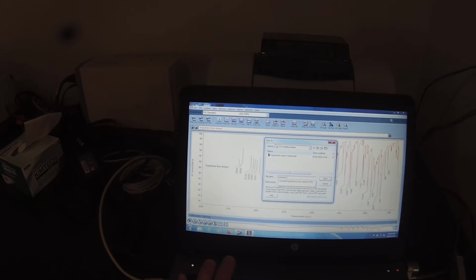So, and it's clearly not a very good match anyway, right? There's the phenol OH stretch. It's not there. This NH stretch is much more noticeable. I'm going to print this one while I'm printing. Corrected tryptamine spectrum.